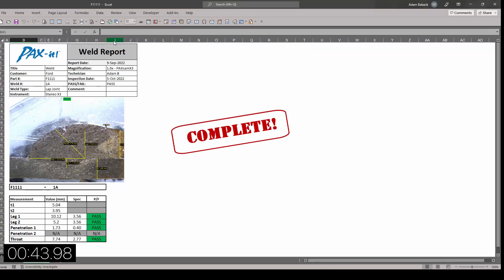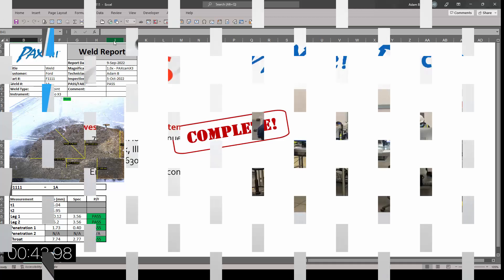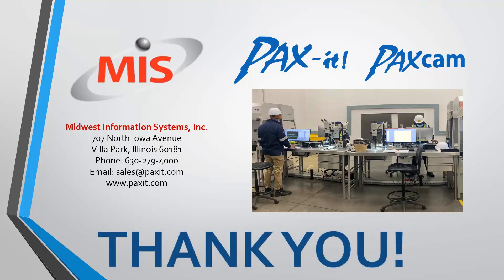Maximizing the efficiency of cut and match inspection in this fashion saves customers hours of time and production costs, making the PaxCam and Paxit imaging system one solution no lab can afford to be without. Contact MIS today to be connected with the appropriate representative for further information and quotation. Thank you.